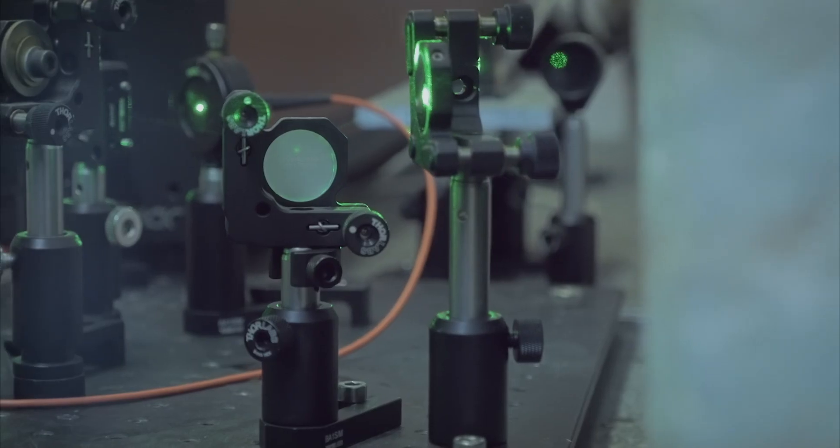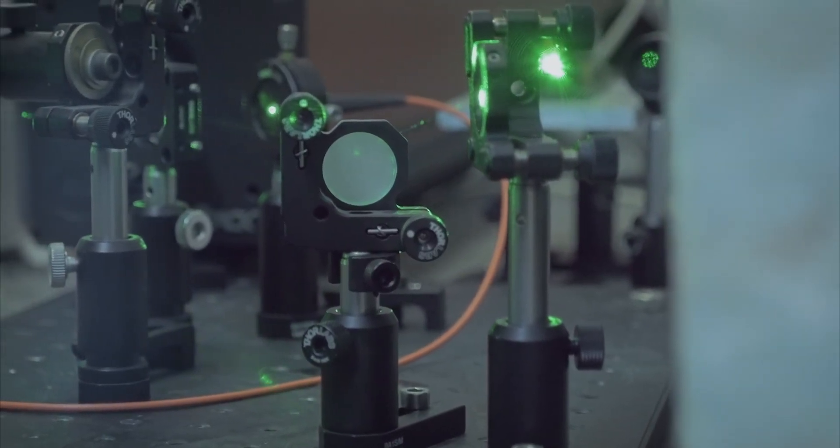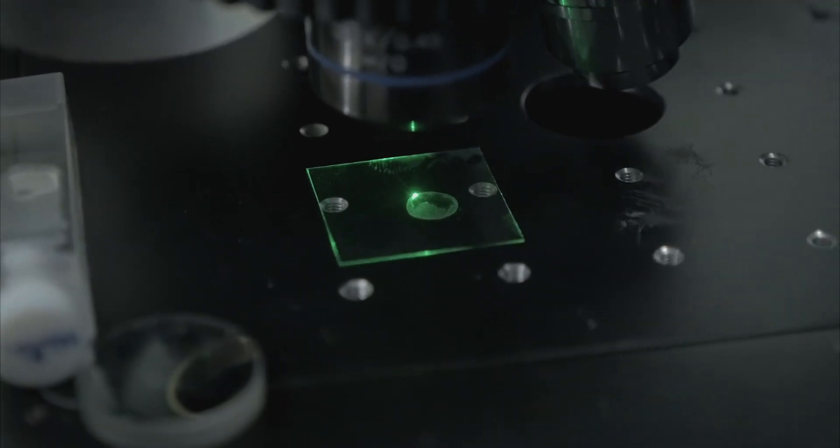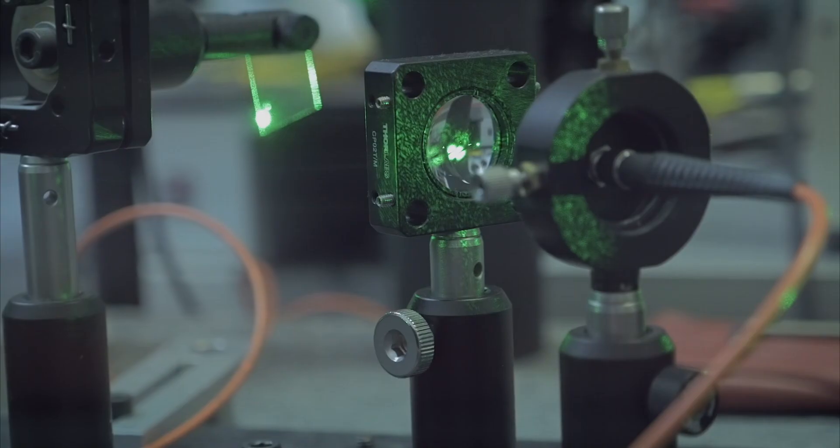Using only laser light, they are able to produce images of live cells that not only tell you what is there, but also the mechanical properties of what is there.